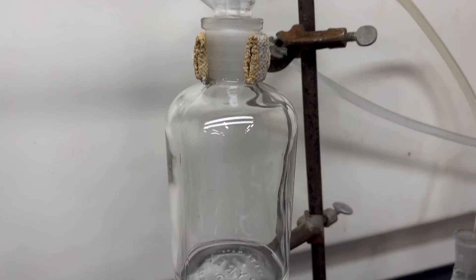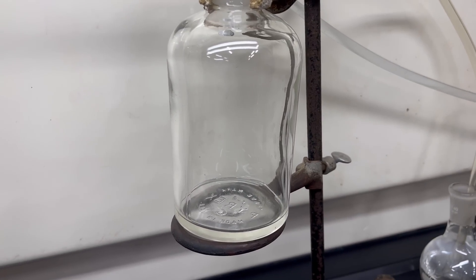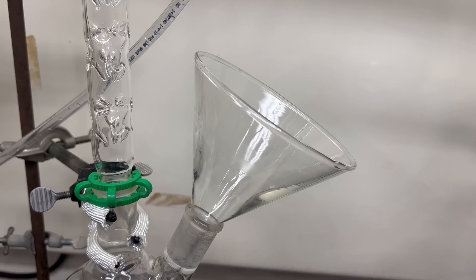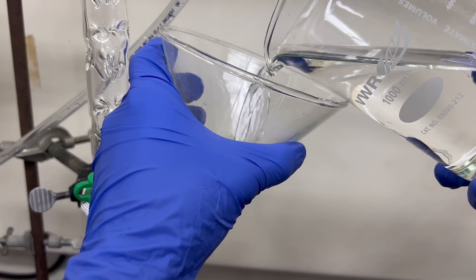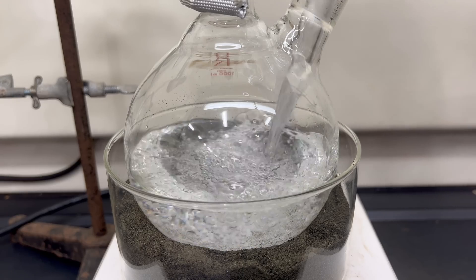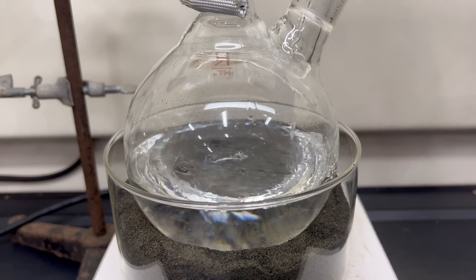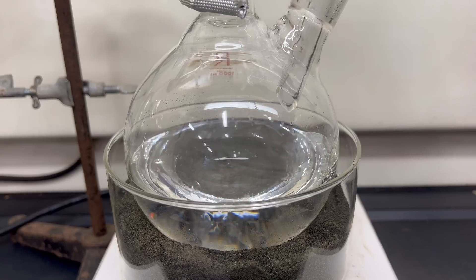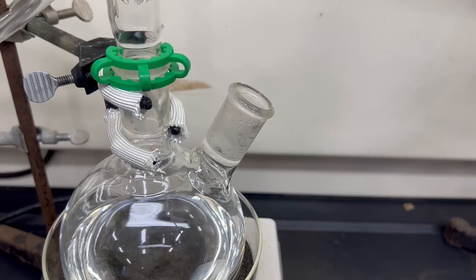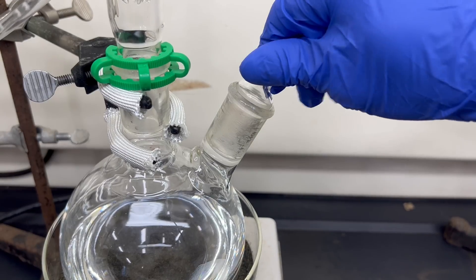After the condenser is the collection bottle. We now add the unknown carbon tetrachloride, hopefully, to the boiling flask. And then stopper the whole thing up.